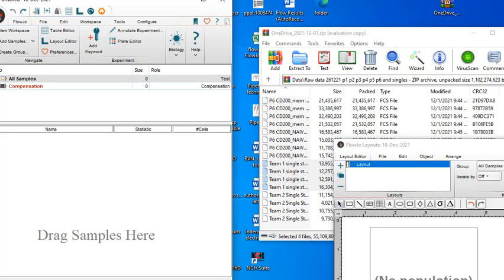Now, flow cytometric analysis is very dynamic, to accommodate all forms of cells, and whatever cell it is, it will be able to measure it. One thing about flow cytometric analysis here, when you look at the hydrodynamic focusing, when it passes through the sheath fluid, and is measured between the long pass and the short pass, whatever it is is measured in frequencies. And with these frequencies, you can further do the analysis using the Flowjo.